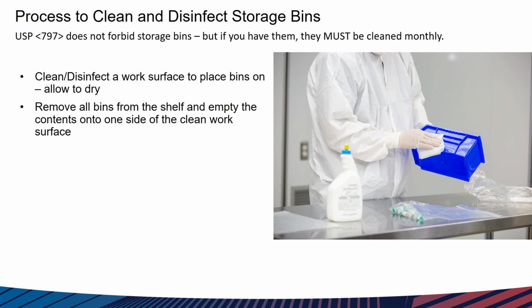So a little tip there to save you some time. Once you've got all the bins off of your shelf, I need to clean and disinfect the shelf. And that means unidirectional, overlapping strokes with a low-lint wiper and a disinfectant, making sure I achieve my dwell time, 1 minute or 3 minutes.